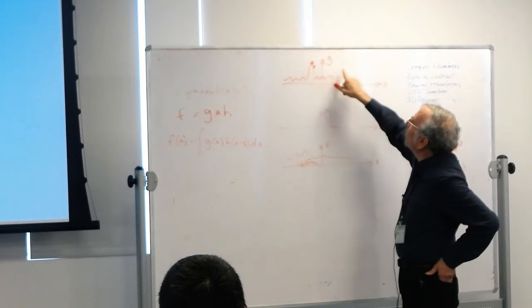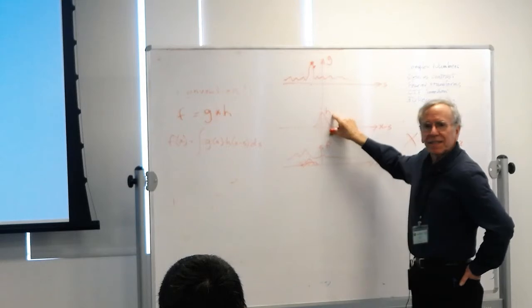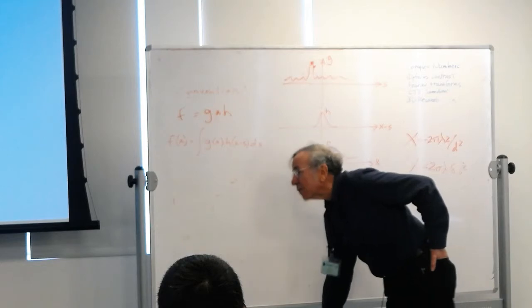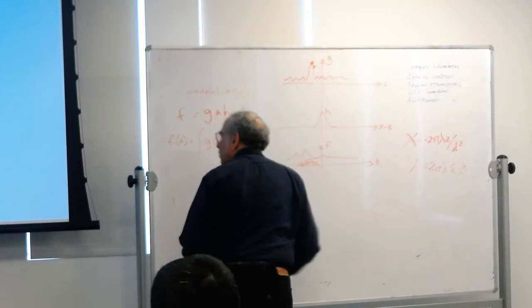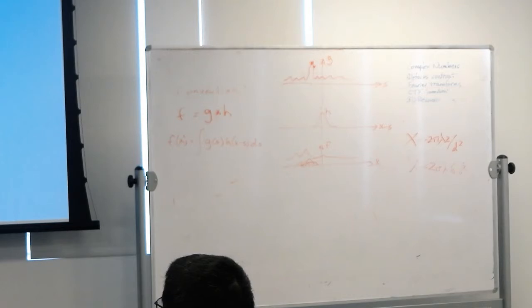We're going to use this. We're going to say, okay, here's a representation of an object. This is the contrast transfer function, and this is the resulting image. We're going to make use of convolution. And convolution has this really cool property, which is helpful theoretically, but is absolutely a huge advantage to people doing image processing, and that is that this complicated integral of convolution turns into just a multiplication of the Fourier transforms.